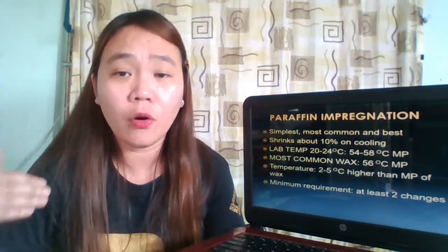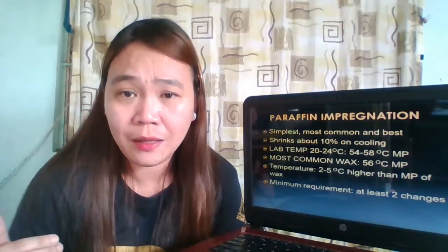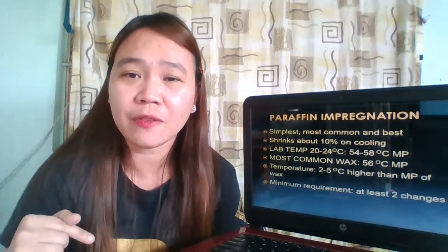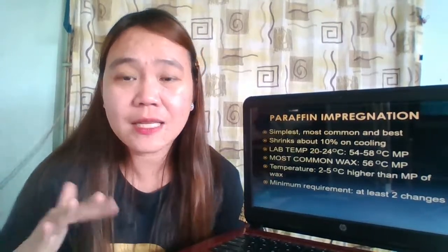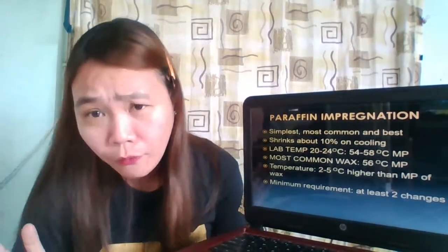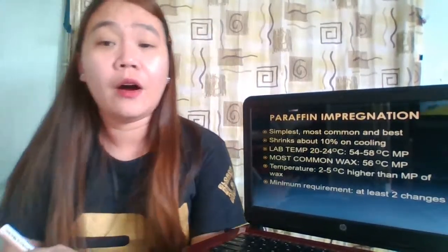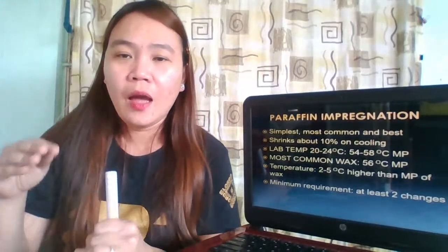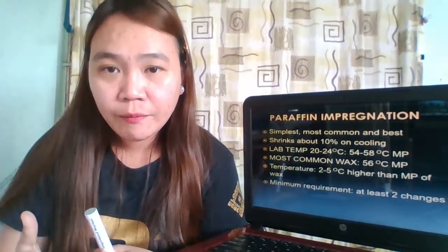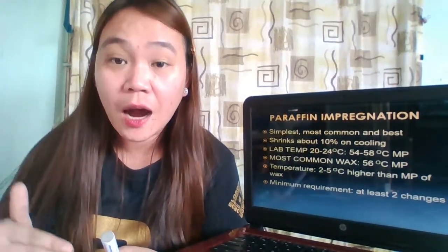So that's why I always emphasize that you have to understand compatibility. If it's compatible, good, or look for something that is compatible. Compatibility is the key here. So again, hard tissues, higher melting point of the wax, and then the block that you produce is hard.